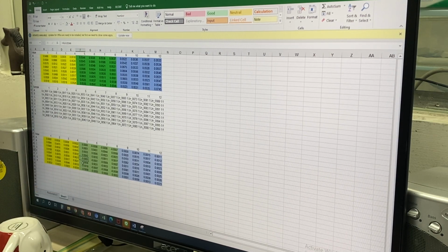So you can put it 0, 0, 0, 0, 0, 0, 0, whatever, if they are minus.